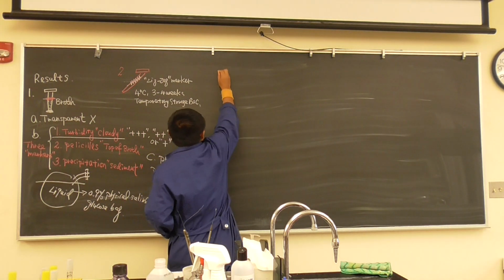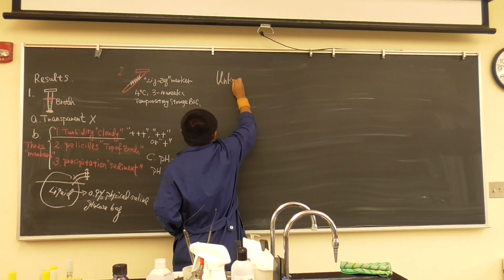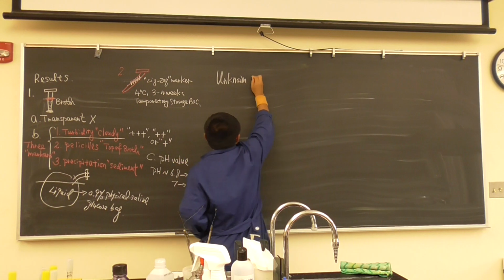Okay, what we're going to do today is unknown identification.